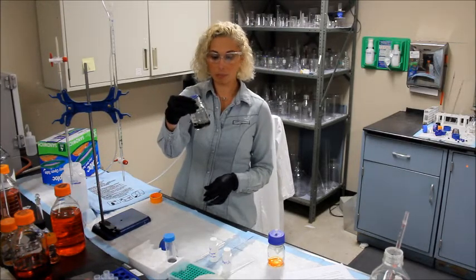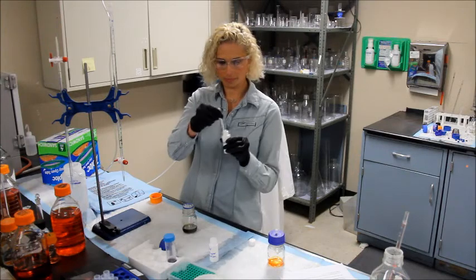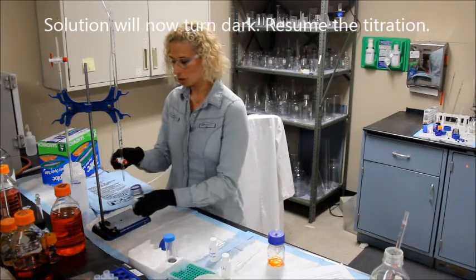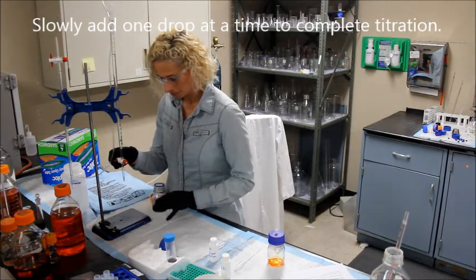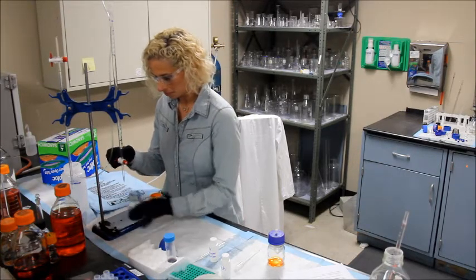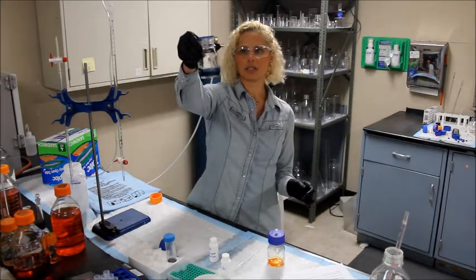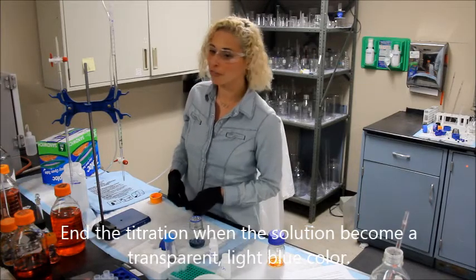You now want to add 1 ml of your starch indicator. This will turn the solution dark, almost black. Now continue the titration — slowly add 1 drop at a time at this point. You know you're at the end point when the solution turns a light bluish color. Note the end point — I'm at 4.8.